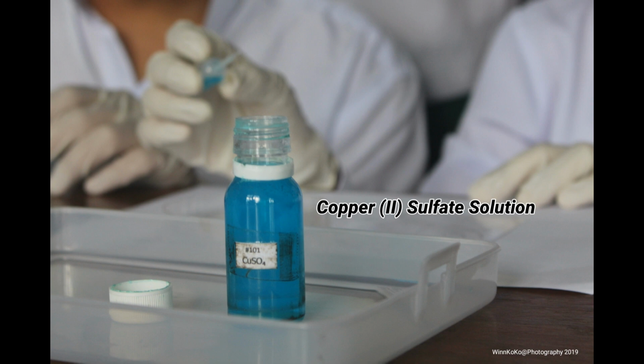What happens to the color of the copper sulfate solution? In this experiment, we'll find that the color of the copper sulfate solution does not change. This is because Cu2+ ions become copper atoms at the cathode and copper atoms turn into Cu2+ ions at the anode, not only at the same time but also at the same rate.